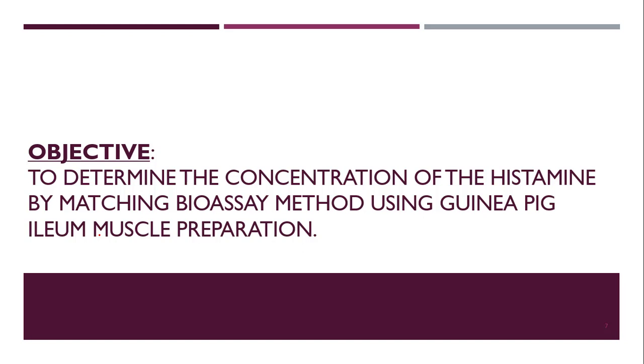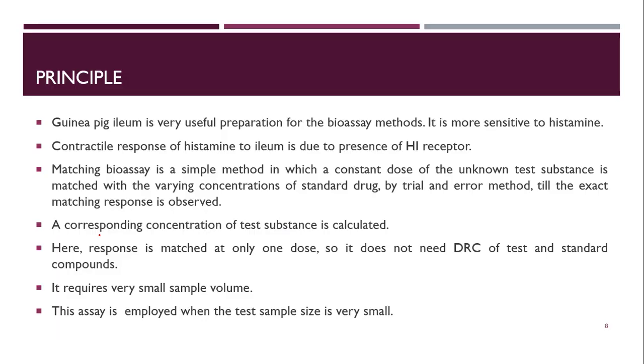ileum muscle preparation. Okay, so the principle: guinea pig ileum is a very useful preparation for the bioassay methods, and it is more sensitive to histamine. So in most of the histamine related experiments, you will find that we use the guinea pigs.